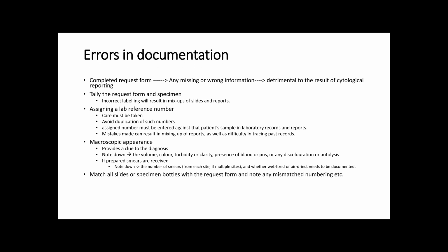Other thing, if a bottle of fluid is sent, the patient and the specimen identification details on the bottle label should match those on the request form. If slides are prepared, the laboratory reference number given on the slide label must match the one given to the request form. Incorrect labeling will result in mix-up of slides and reports.